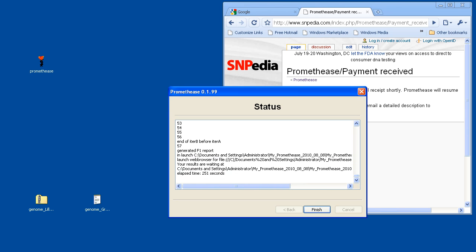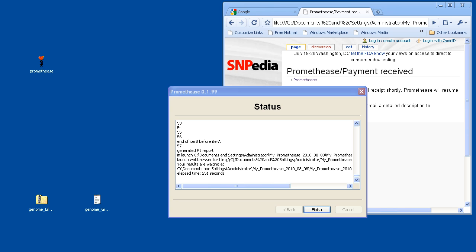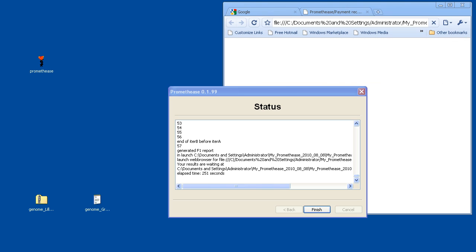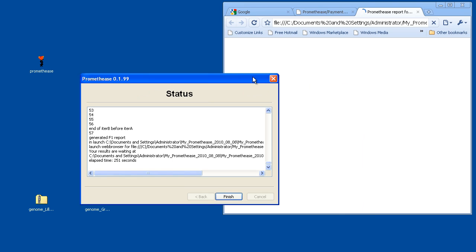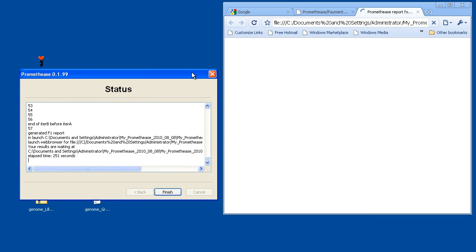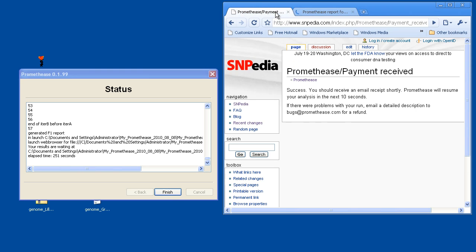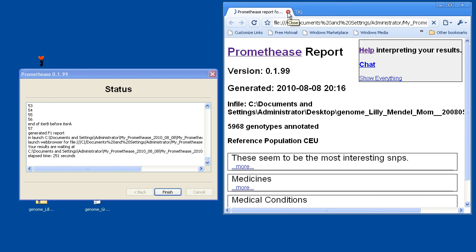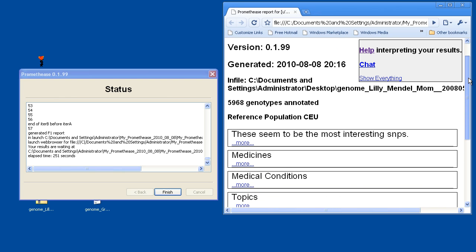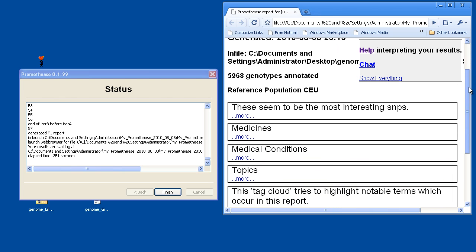Okay. And at this point, Prometheus has again launched your web browser and is opening up the HTML file that shows the full Prometheus report. I'm going to move this window just a bit out of the way so we can spend more time looking at the web browser instead. And close a couple of tabs that we don't need anymore as well. So here we are looking at the Lily Mendel Prometheus report.